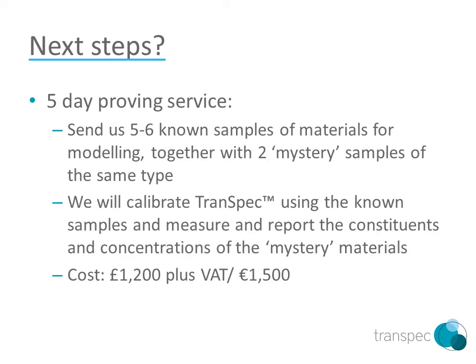If you have a specific material of interest that you would like to test with TranSpec, then we do offer a 5-day proving service. We require 5 to 6 known sample materials to build a model, typically a concentration range of an additive. We then build and calibrate TranSpec to this, and then test it on a supplied mystery sample, and we report this back to you so that you can build confidence in TranSpec with your materials. We do charge for this service to help cover some of our costs.